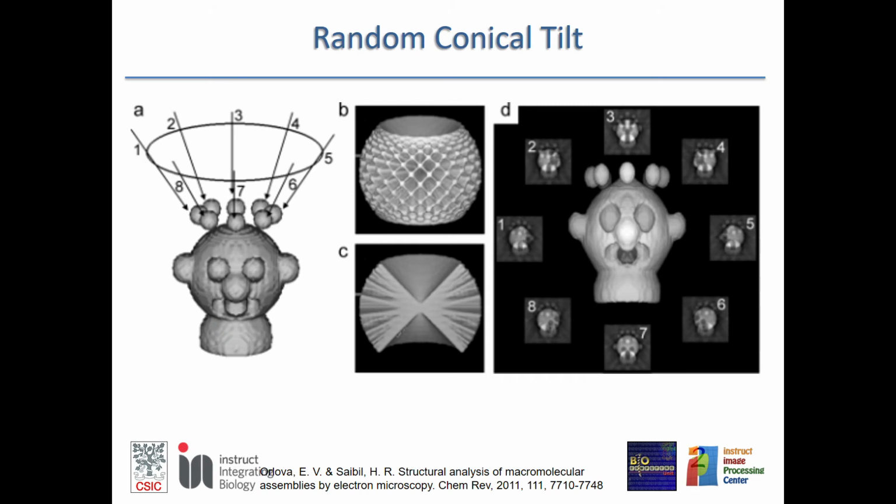Again, details we can skip. There is this problem of the missing cone. The reason is related to the central slice theorem. Every projection that we have from an object gives us a plane in the 3D Fourier space. These projections fill the 3D space, sampling it in a more or less regular way, except for a cone.